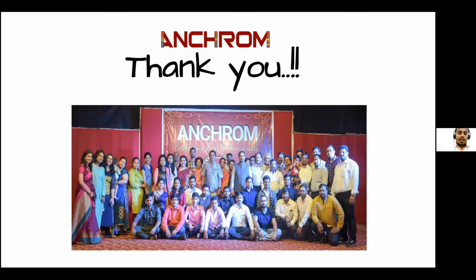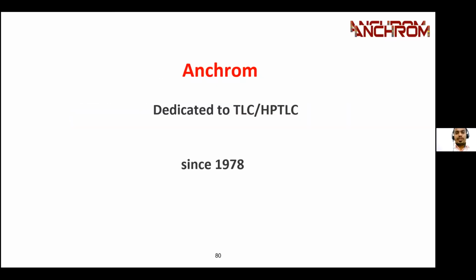Now, I will use 10 minutes. I will show some of the analysis for the food dyes. So I will switch to my colleague's PC, and I will show it there.